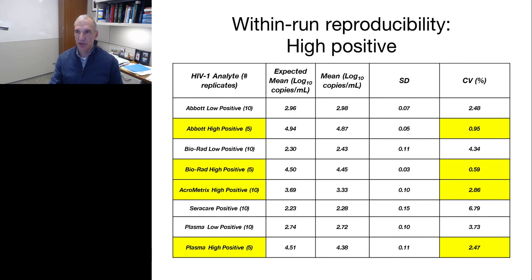As I mentioned, the second part of this experiment was looking at stability over time. Unfortunately, we're calculating the data right now. My research tech performed those experiments this week, and I was not able to have that in time for the presentation. But we'll be evaluating how stable these controls are over 6 months. That's what the packaging shows, the expected stability is 6 months, and we want to evaluate that.